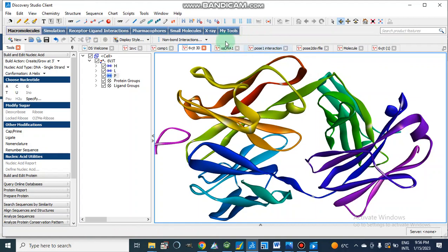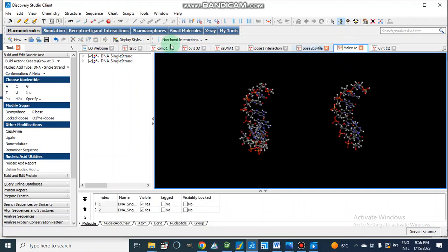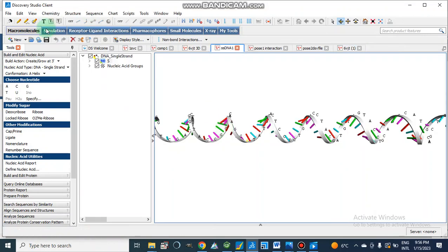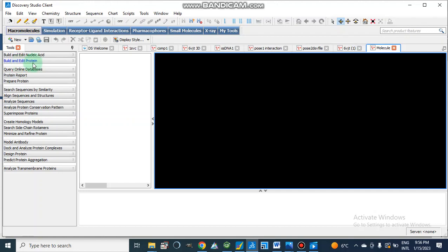Now in the case of DNA, let's suppose this is our single-stranded DNA which I want to dock with that protein antibody. I will show you how we can build this structure from the beginning. We will go to File, New Molecular Window, then go to Macromolecule. In Macromolecule we have options to Build and Edit Nucleic Acid, Build and Edit Protein, go to online databases, and prepare protein. Here I am going to use Build and Edit Nucleic Acid.